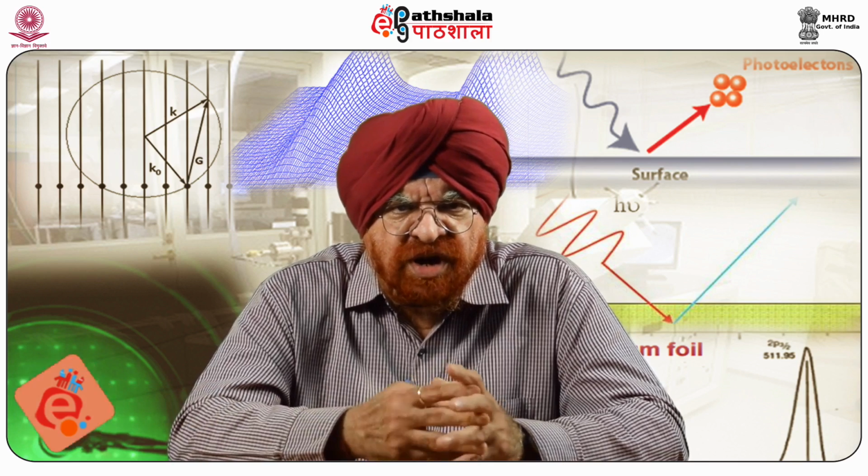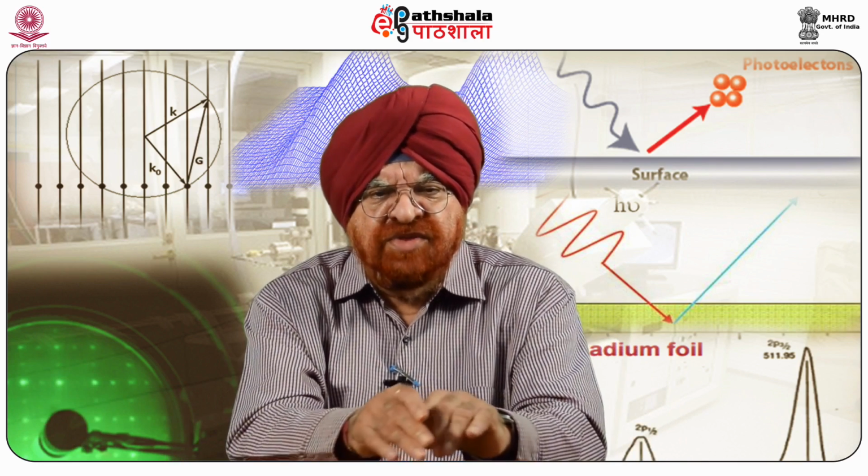The binding energy of the electron, as I said earlier, can be given by the equation here, which is equivalent to h nu minus Ek minus W, where Ek is the kinetic energy of the emitted electron from the spectrometer. I'm sure you would have appreciated this study of ESCA. Thank you very much.